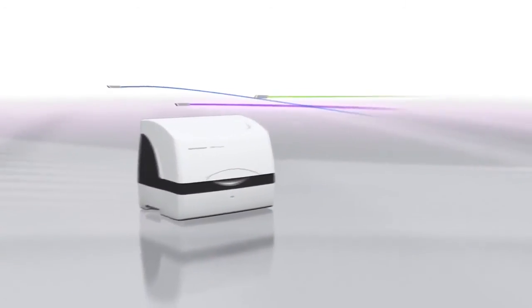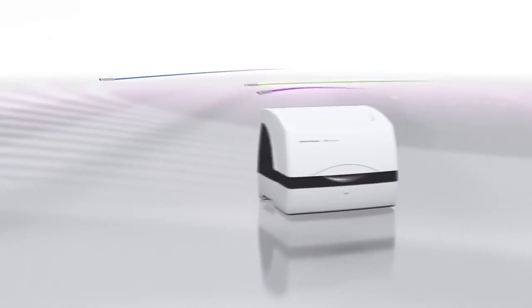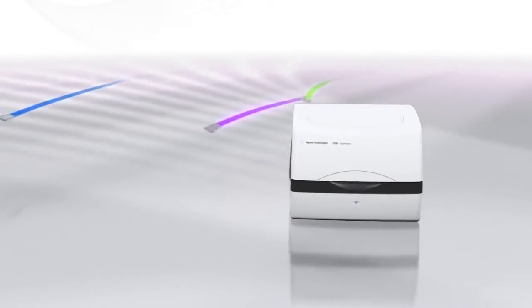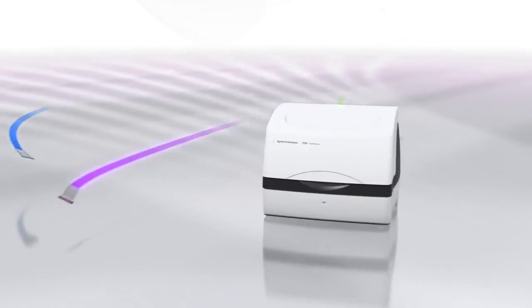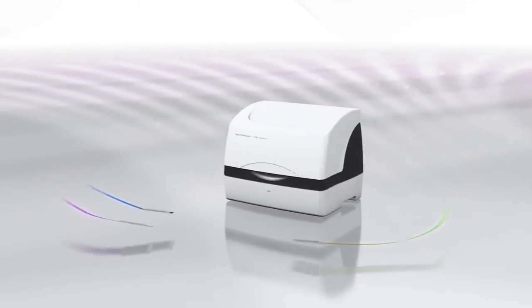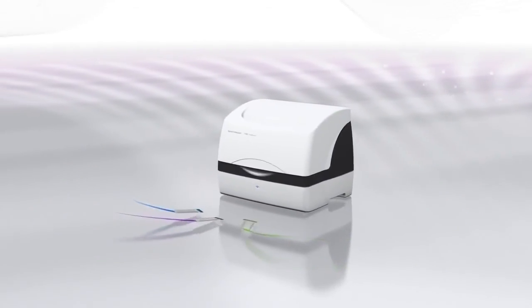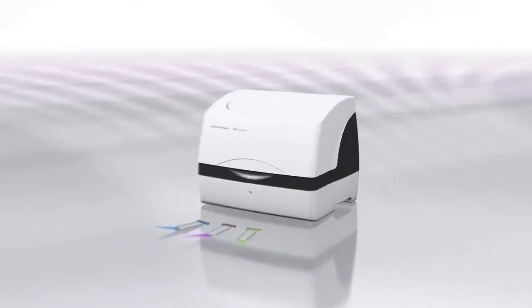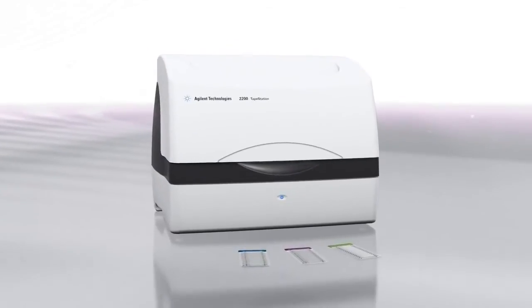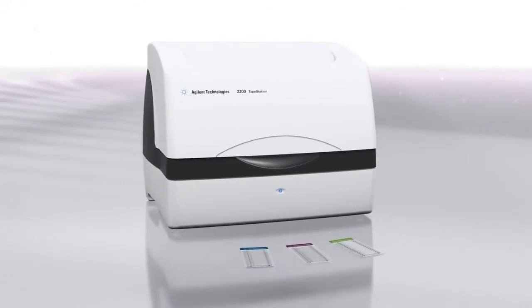Capable of handling 16 tube strips or 96 well plates, the Agilent 2200 tape station offers scalable throughput from 1 to 96 samples, while keeping the cost per sample constant.